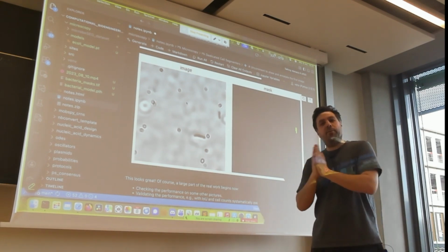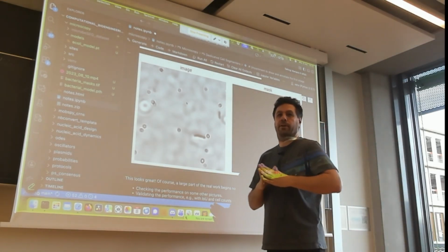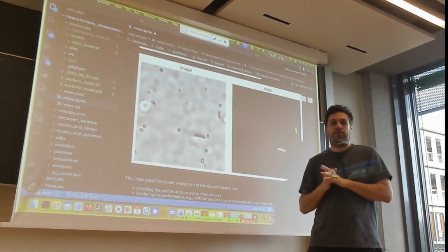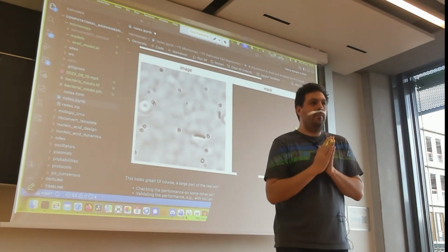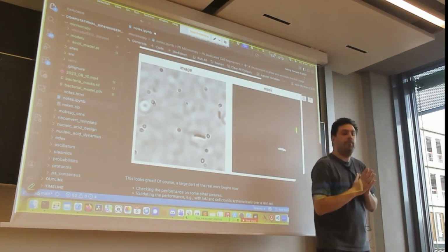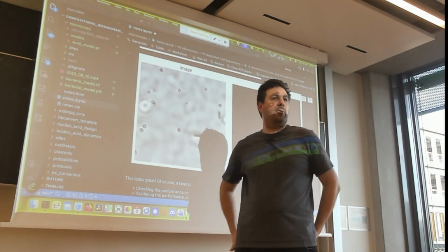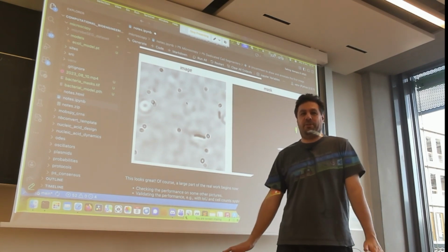It comes with the problems of a GUI-based method, of not having code as a first principle run through your process. But there's nothing wrong with ImageJ, of course. And I think there is this successor library which is called Fiji. You might want to look also into this. They are very good tools, definitely. Did this answer your question?